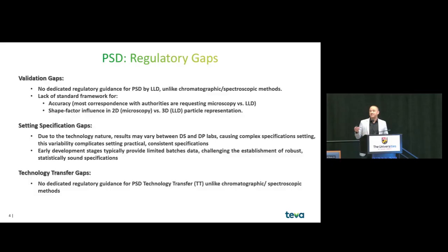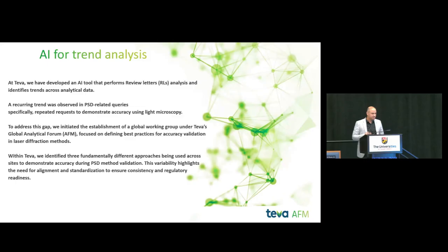There are sites who have decided not to participate in technology transfer. They say, just send us the method. We'll take the method, we'll develop our method, we'll validate the method from scratch, which is easier for them instead of performing technology transfer. Not because the method is not robust or something. That's because of different technology, different people. We have even found cases where different humidity in different places will affect your result.